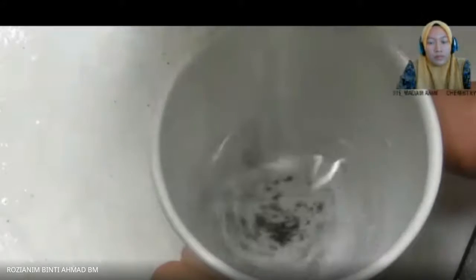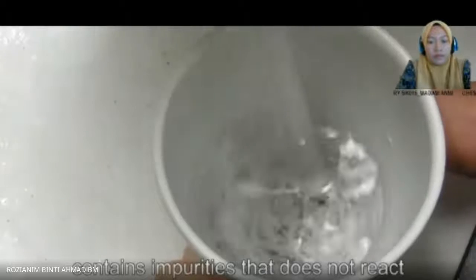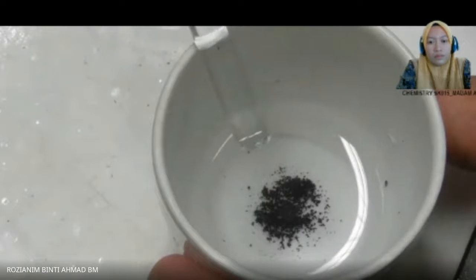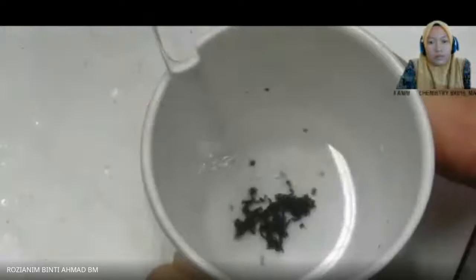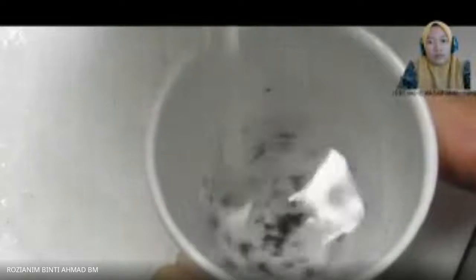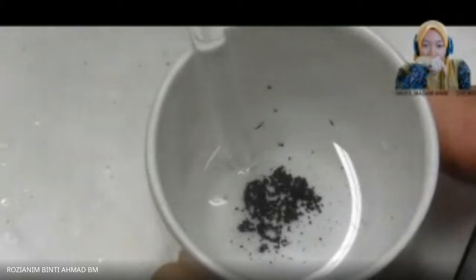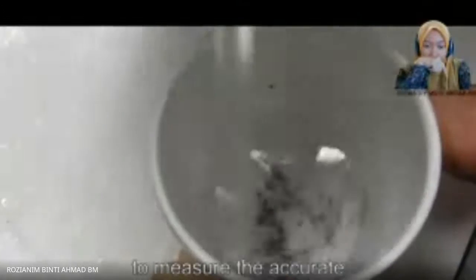Sometimes the zinc powder contains impurities that do not react with hydrochloric acid. To check whether the solid left in the mixture is zinc or impurities, add more hydrochloric acid. If the solid is not zinc, there will be no reaction and no gas bubbles will be formed. If the solid is zinc, there will be a reaction and gas bubbles will be formed. If that happens, you may need to add more than 10 milliliters of hydrochloric acid. That is why it is not necessary to measure the accurate volume of hydrochloric acid.